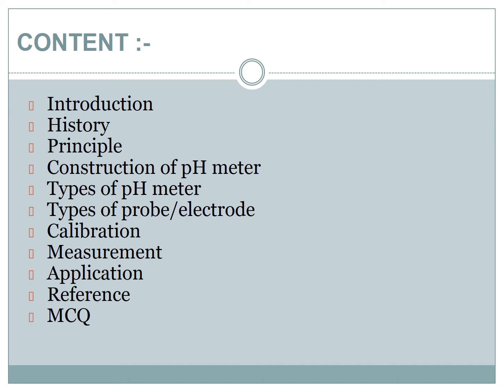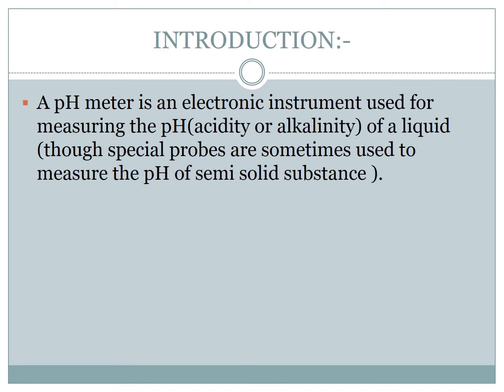After that, we discuss calibration, how we calibrate it, then measurement, then application, and in the last we discuss references. Okay, now we start with the first, the introduction.